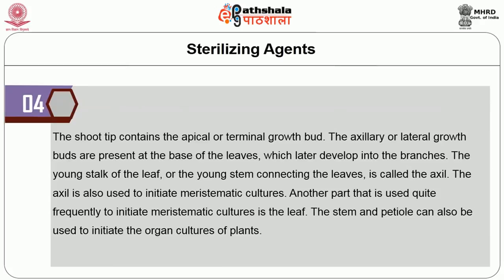The axillary or lateral growth buds are present at the base of the leaves, which later develop into the branches. The young stalk of the leaf or the young stem connecting the leaves is called the axil. The axil is also used to initiate meristematic cultures. Another part that is used quite frequently to initiate meristematic cultures is the leaf. The stem and petiole can also be used to initiate organ cultures of plants.